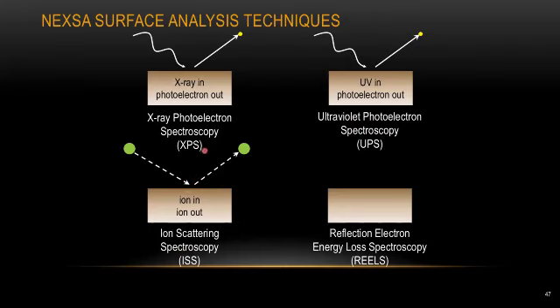So don't get confused between the ISS measurement and SIMS. I know last week my colleague Austin was talking about SIMS and atom probe. For SIMS, what we are monitoring for the particle is the mass, but for the ISS measurement, we are monitoring the energy of the particle.